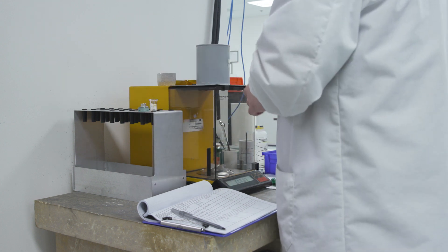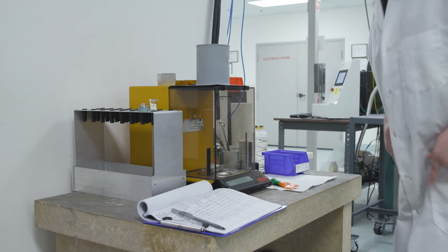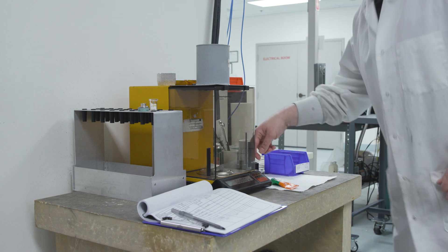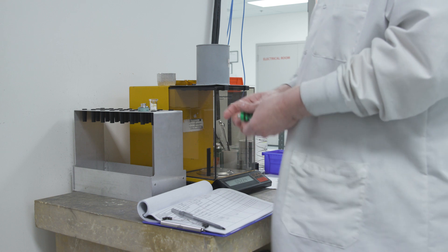He tamps the penetrometer lightly to settle the sample and discards the piece of pipe cleaner. He places the weighing pan back onto the balance to make sure he transferred all the sample to the penetrometer. Now it is time to seal the penetrometer.